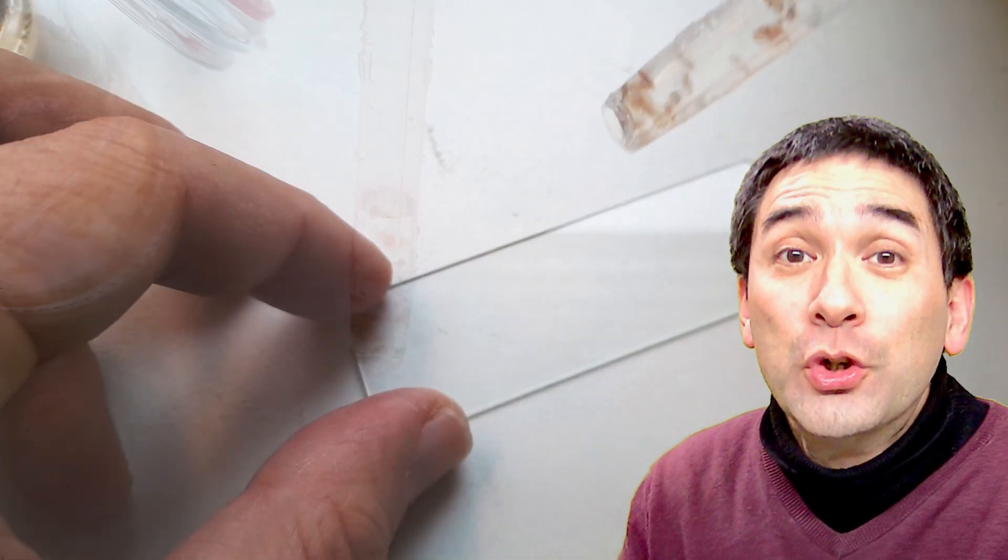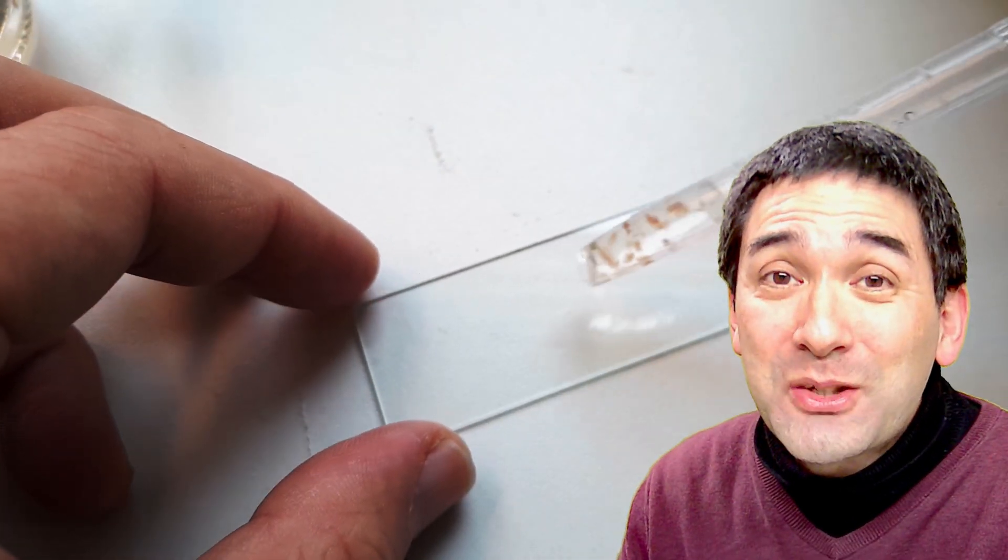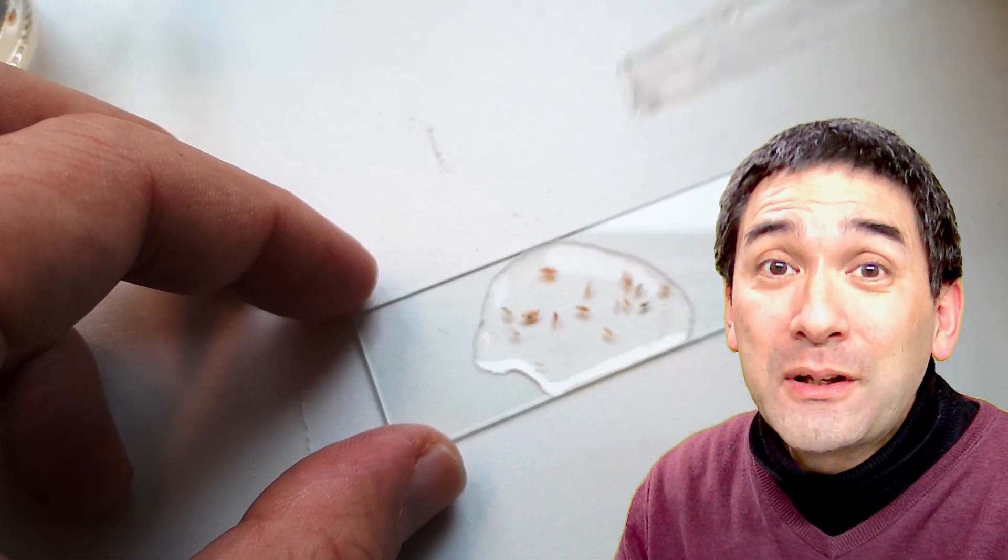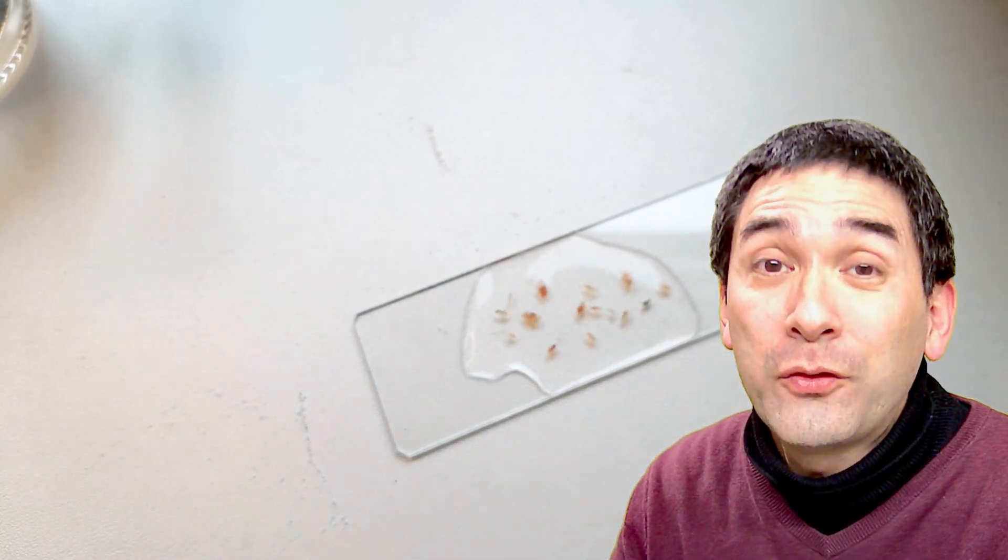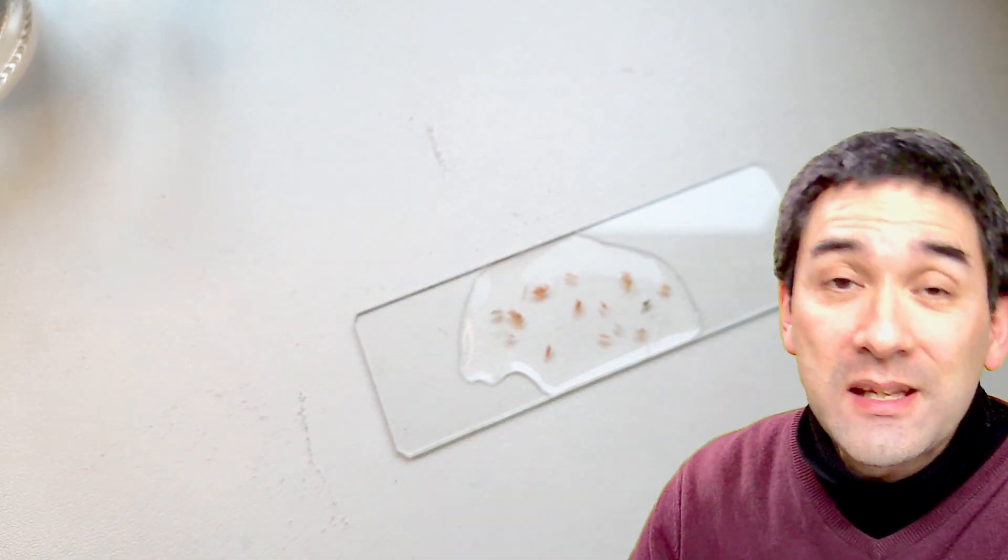And of course they do have a nervous system, even if the nervous system is quite simple and much simpler than our human nervous system. Of course alcohol still does have an effect.